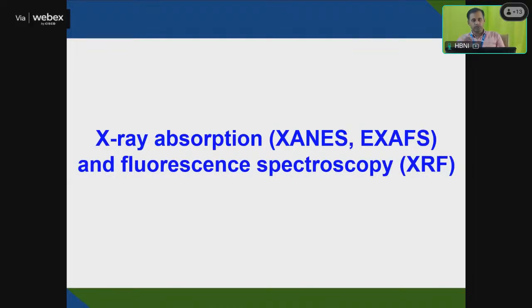neutron diffraction, mostly the wavelength is fixed. Lambda is around, like in Dhruva we have around 5.4 angstrom or something in that range, 4 to 5 angstrom wavelength lambda. So that is almost fixed. That wavelength you can't vary in a neutron diffraction technique.